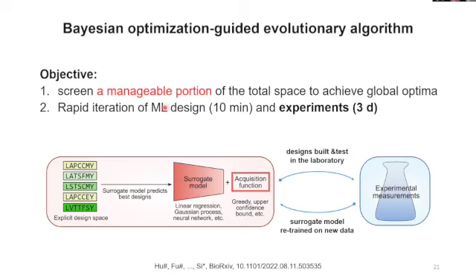So as you can still see, the machine learning designs take only a very tiny portion of the time. The experiments take longer, because E. coli need time to grow, at least 3 days, but in those 3 days we can sample about hundreds of thousands. So that's where we do this optimization.